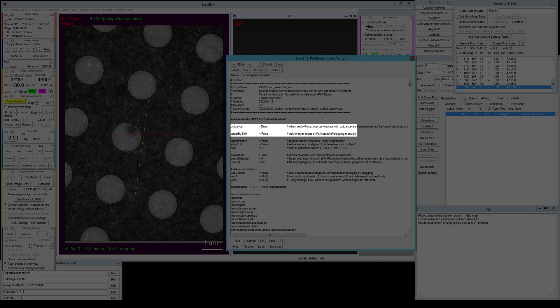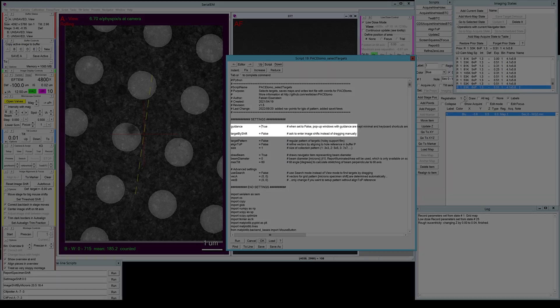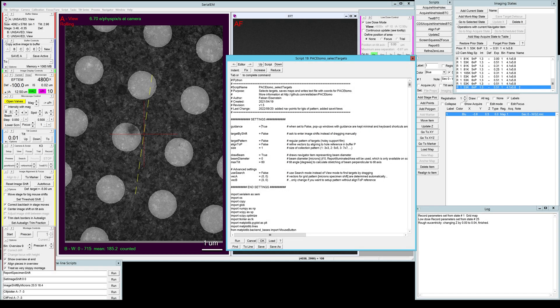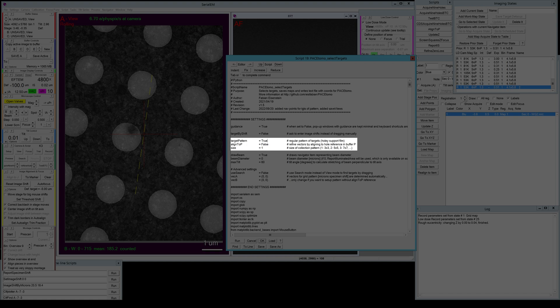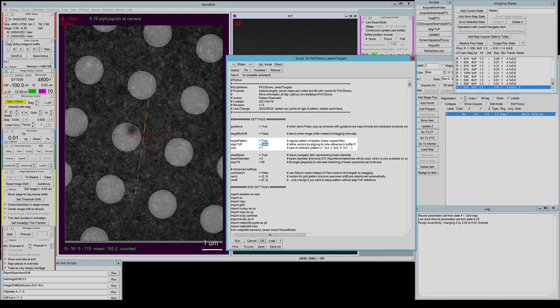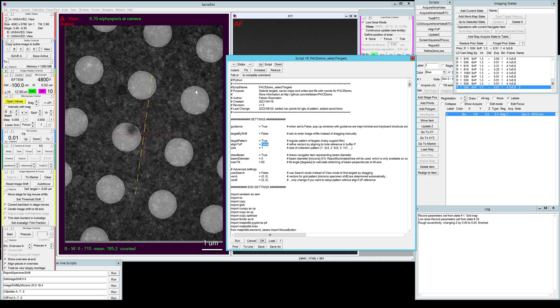For a target pattern this doesn't make too much of a difference. We're gonna set target by shift to false because we want to set the target by a pattern, so we're gonna set this to true. We also gonna set align to P to true.